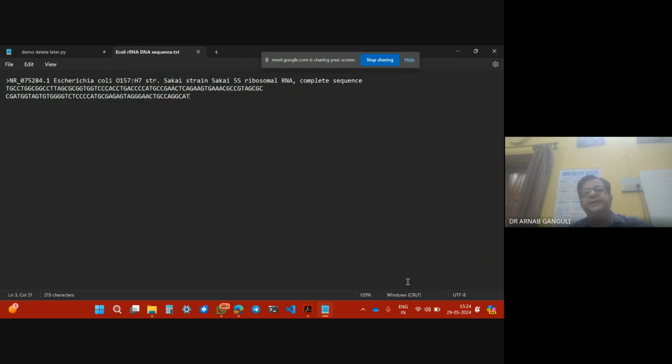So I'm keeping this now. This is saved, has to be saved.